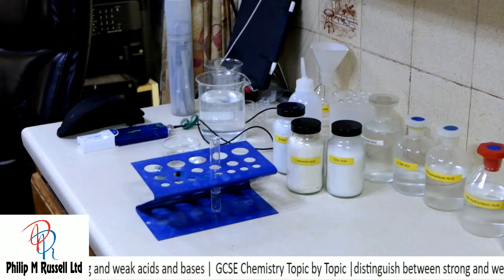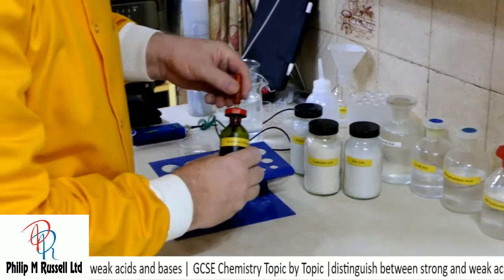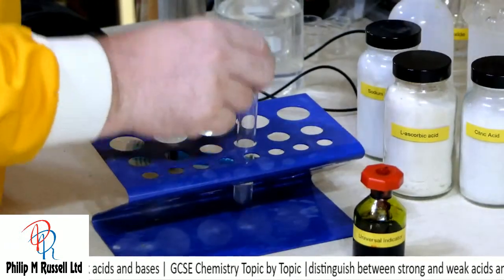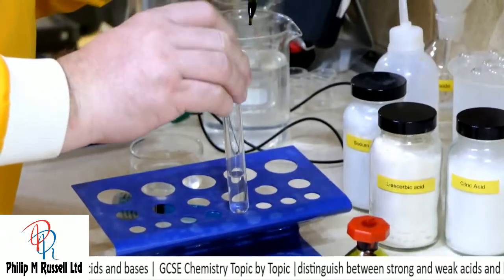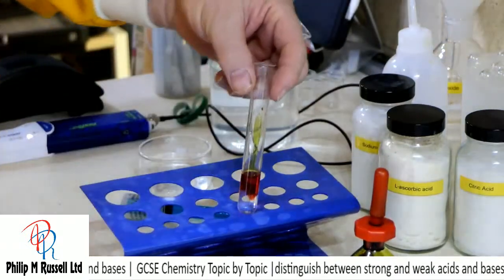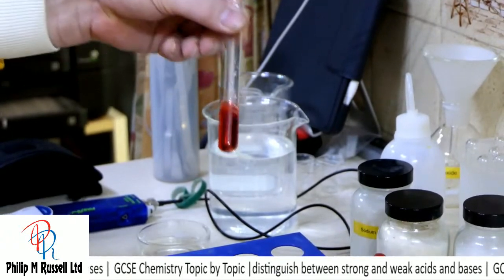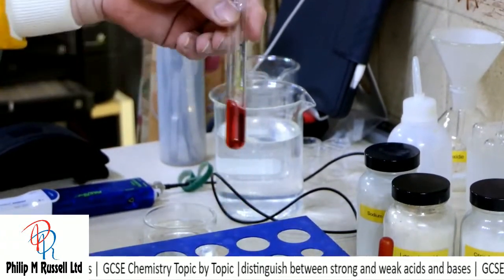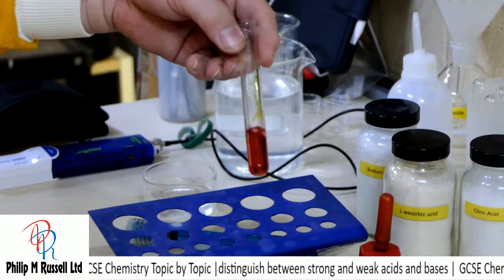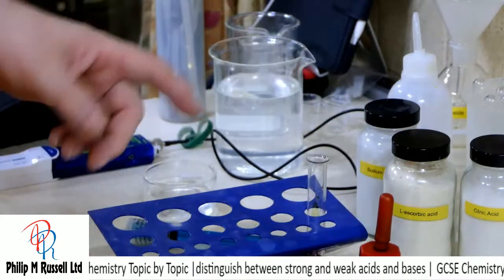And cleverly I put that on the table, so I have to go and get it. Bit of universal indicator. We know from universal indicator reds are acids, so let's try this one. Let's just put in a little bit, and we can see immediately that has gone really quite a strong red colour. So that is very acidic, and I wouldn't fancy putting my finger in there.